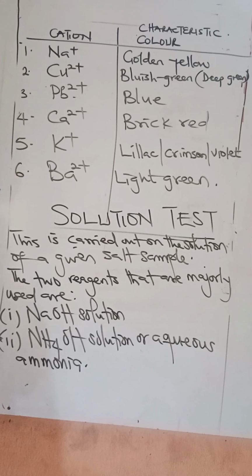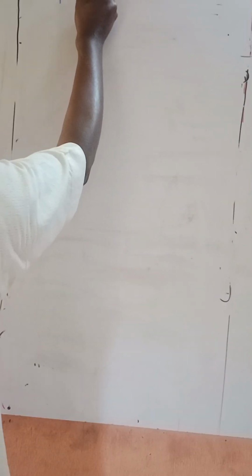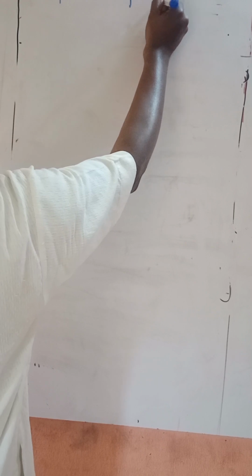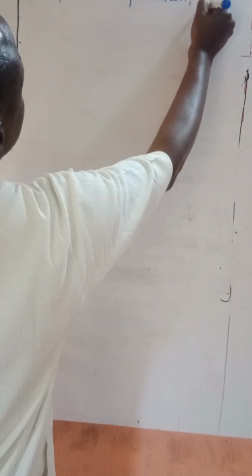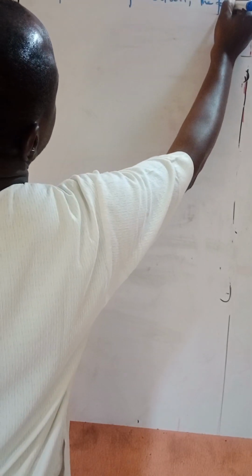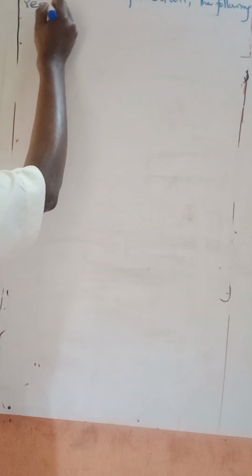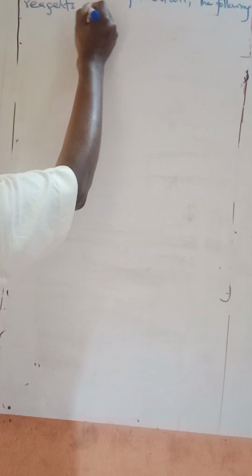But for further confirmation, the following reagents could be used.